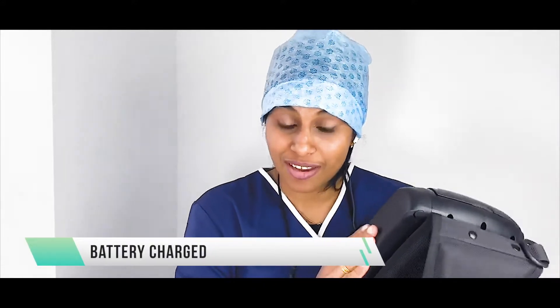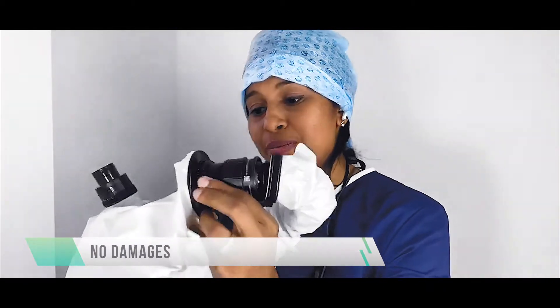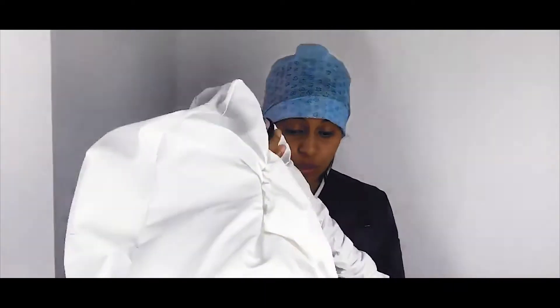First, check that everything looks good and the battery is fully charged so it doesn't go off during your procedure. Second, check for any visible damage or tears. These are reusable — they are wiped down, cleaned, and ready to use. Once you've checked for damage, you're ready to proceed with donning and doffing.